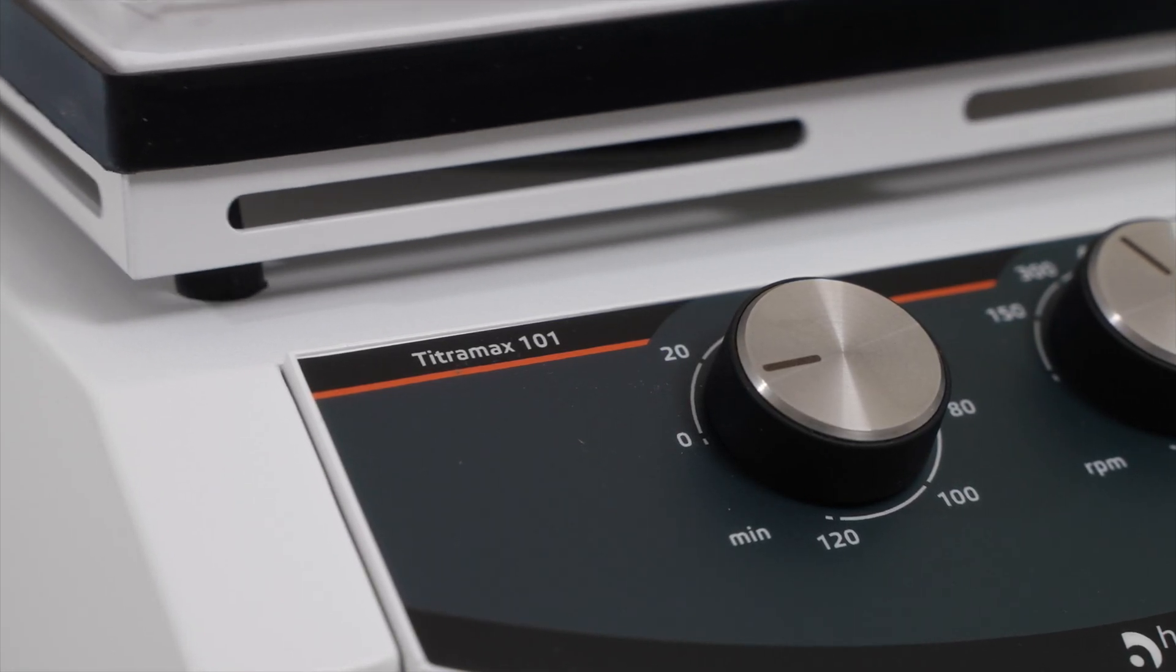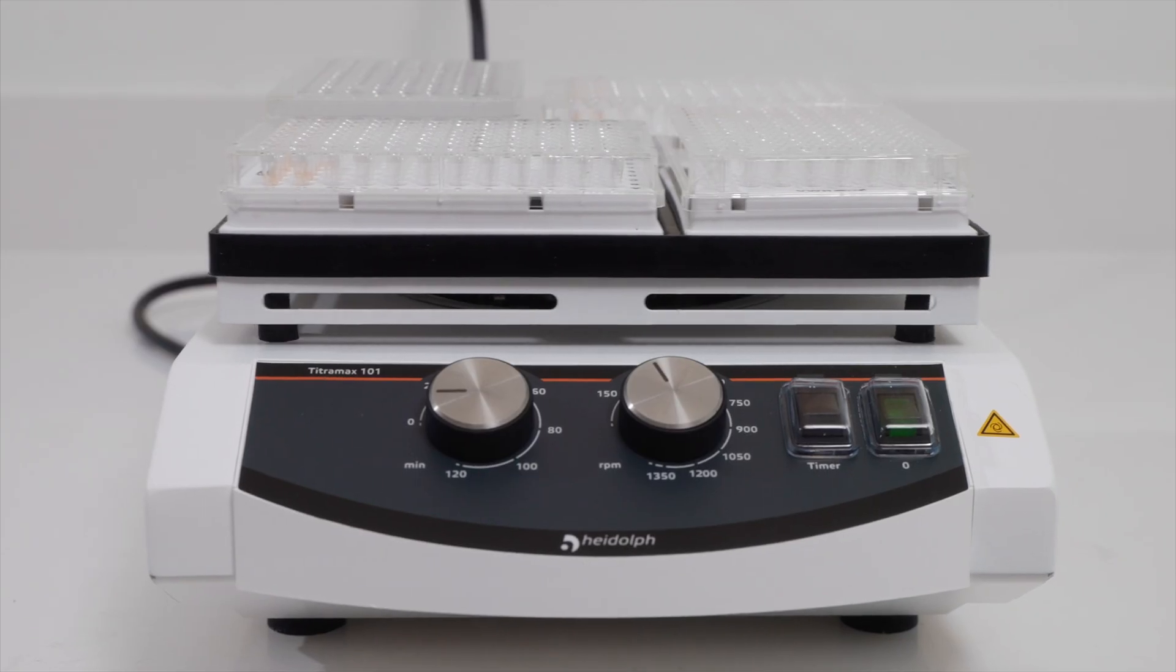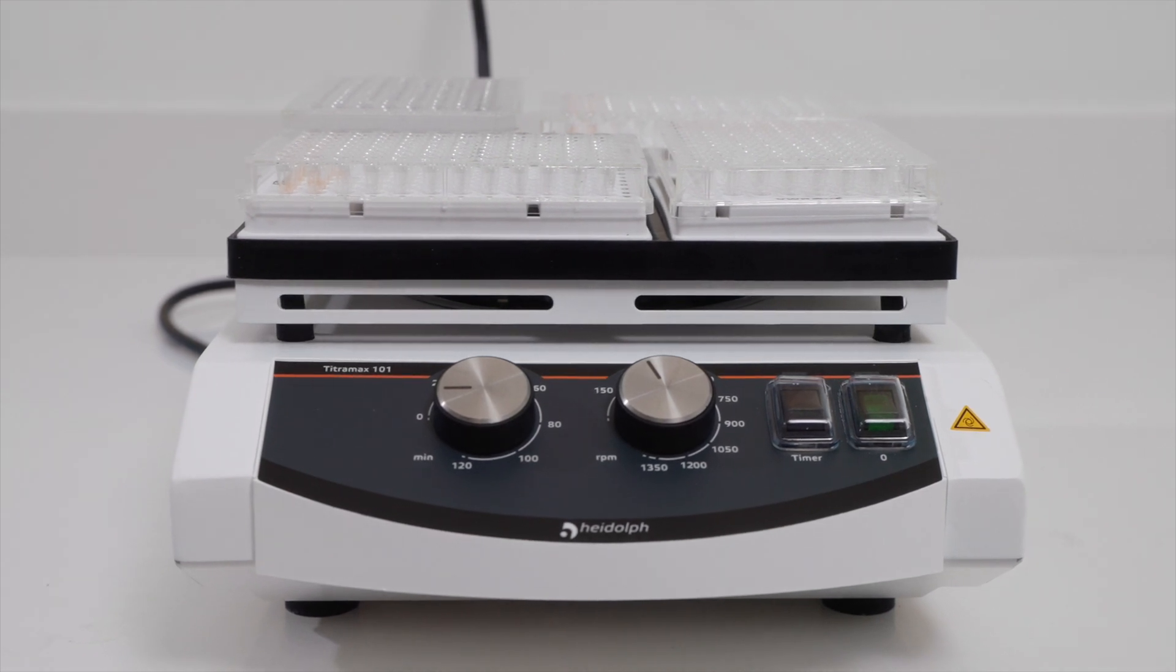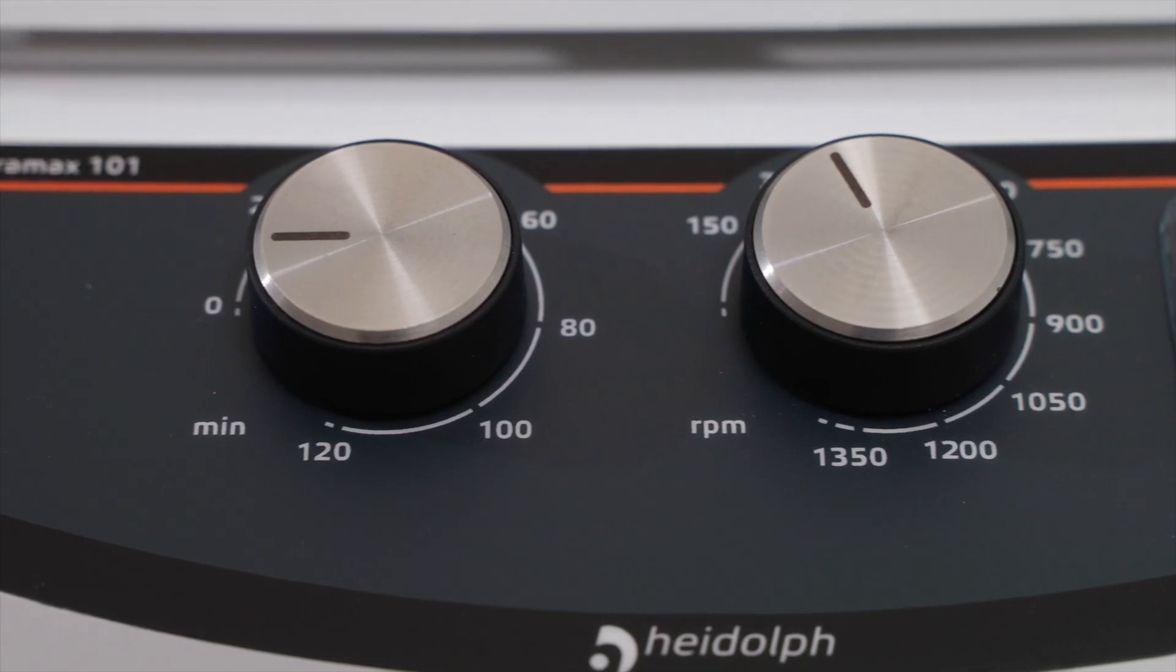Like the Titramax 100, the Titramax 101 can hold up to four micro-titer plates at once, has a speed range of 150-1350rpm, and has a built-in timer.